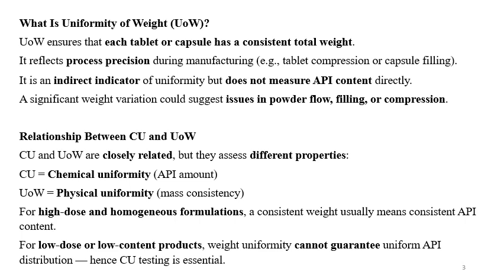A significant weight variation could suggest issues in powder flow, issues in the machine parameters, or issues in the filling or compression. So during in-process, the weight variation test or uniformity of weight is important.